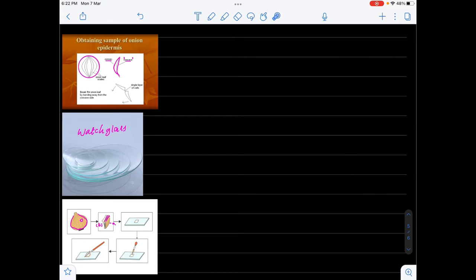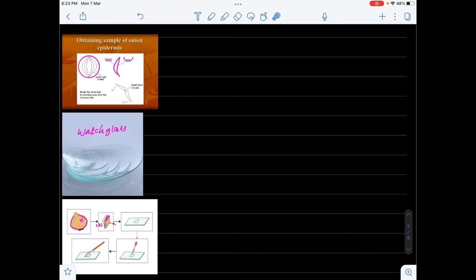If the onion peel is longer, we should take only a small portion and place it on a glass slide containing water. Now add a drop of saffronin solution to stain the different components. Saffronin is a coloring reagent which makes all the components of the cell more clearly visible. If extra stain is added, it must be removed with the help of blotting paper. Then we need to add a drop of glycerin to prevent the material from drying. Finally, we should cover it with a cover slip and observe it under the compound microscope.